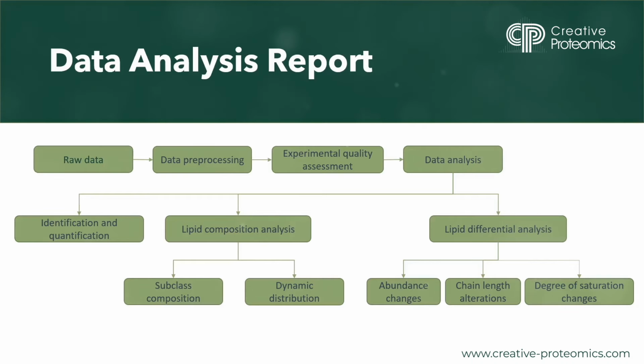Finally, to gain a deeper understanding of the biological implications of our findings, we employ pathway analysis. This involves mapping the identified lipids onto relevant metabolic pathways using tools such as KEGG or MetaboAnalyst. Pathway analysis helps us unravel the complex biological processes underlying lipid-related diseases.